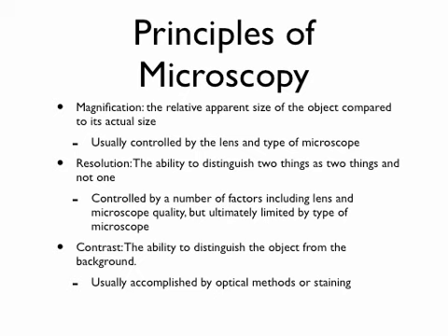It will be totally pixelated, blurry, big, but not very useful. So magnification in and of itself is not always a super useful thing if it's not accompanied by an increase in the other attributes that we talk about as well. Magnification is usually controlled by the type of microscope that you're using and the type of lens that you're using.